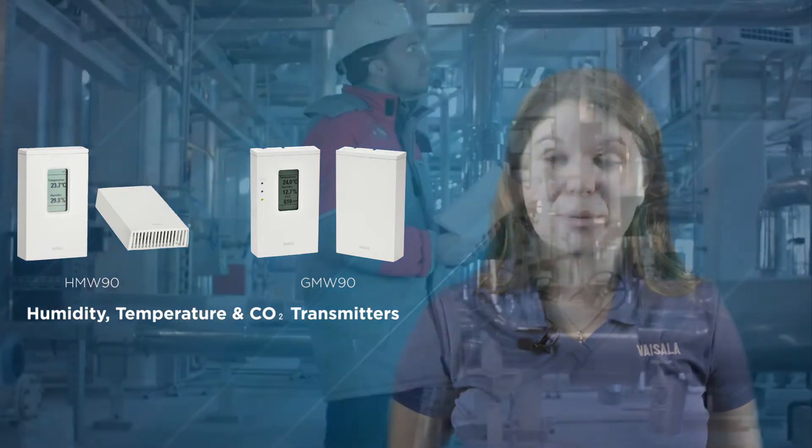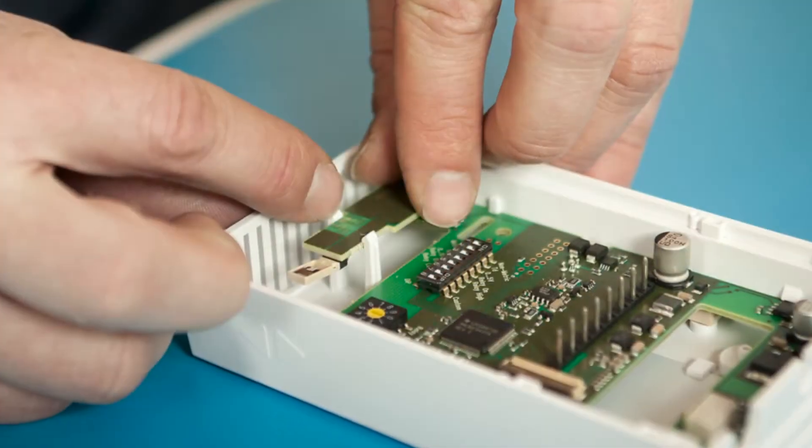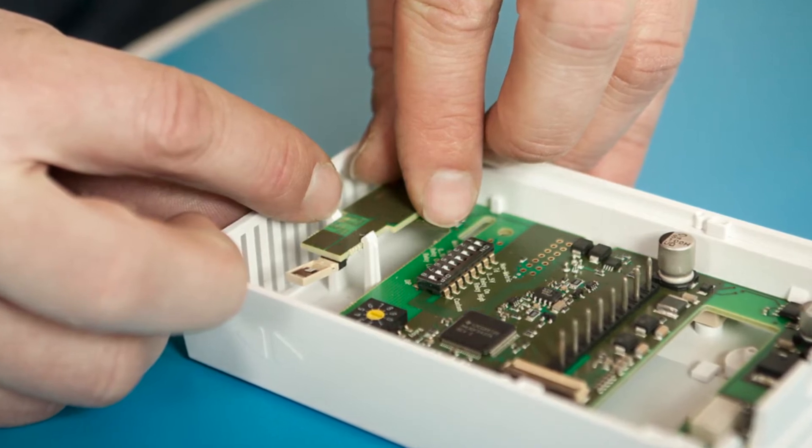If you require calibrations as part of your regularly scheduled maintenance, there's a quick and easy solution. Calibrating is as simple as changing out the humidity, temperature, or carbon dioxide measurement module. Each of these modules comes calibrated with a calibration certificate, so once a new module is installed, you can walk away knowing that you have a freshly calibrated instrument.